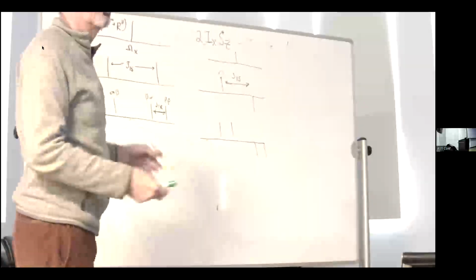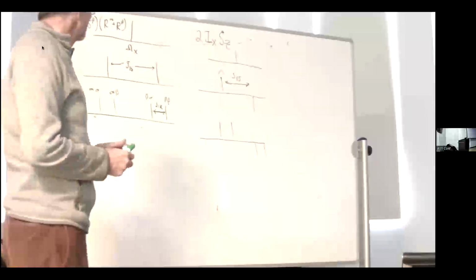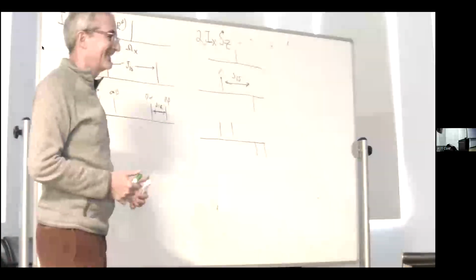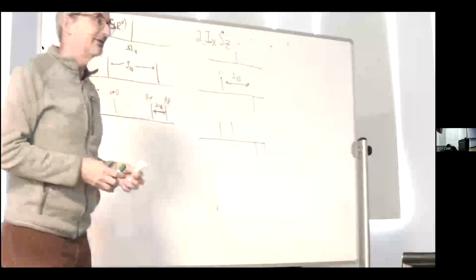And so on and so forth through the rest of this problem. But the main trick, I think, is always start with the biggest coupling. And then you can't get confused about which state is which.